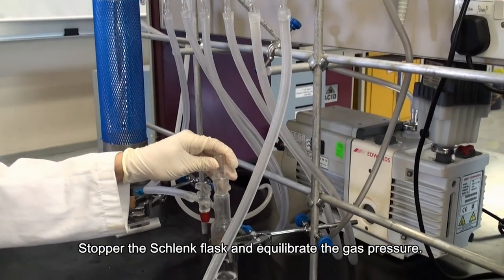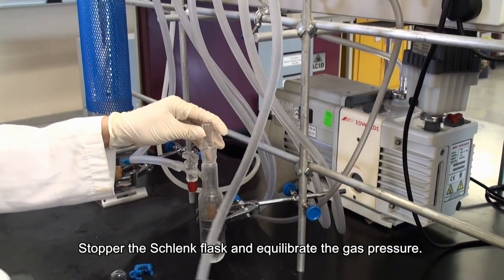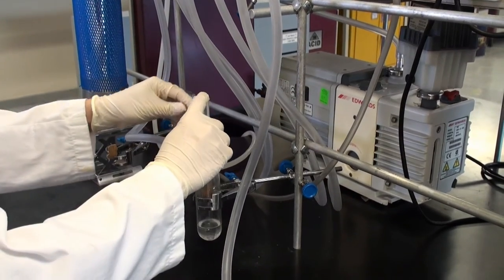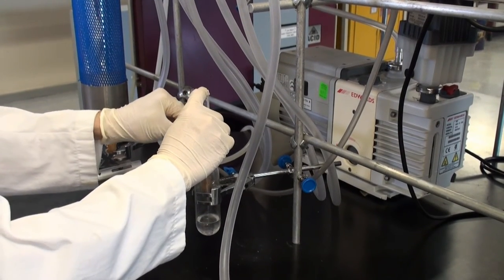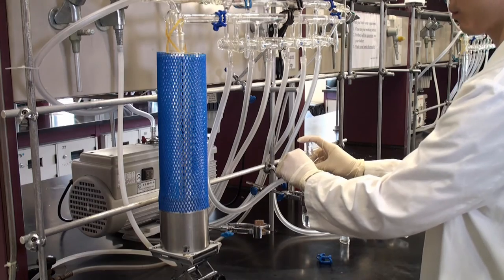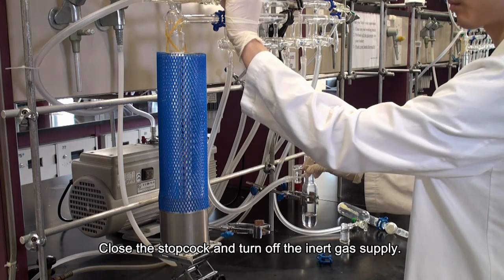Stopper the Schlenk flask and equilibrate the gas pressure. Close the stopcock and turn off the inert gas supply.